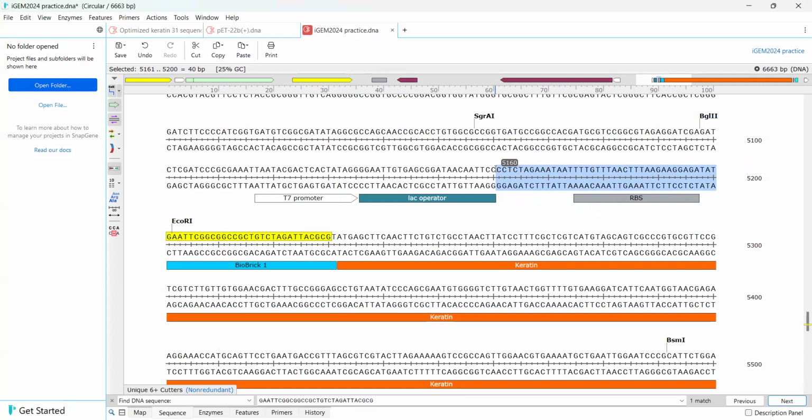Usually 25 is good, but because this has a lot of ATs and on the other side of the DNA there will be many more GCs, there will be a huge difference in TM, and we're trying to keep the TM of the overlaps in the same range. It's not always possible, but we are doing our best. Oops, I messed up. So this is where it goes. Control C, and then we go to this TM calculator. Let's see where our second extension is.